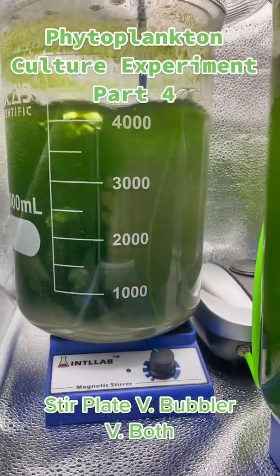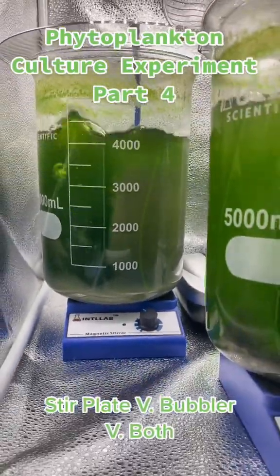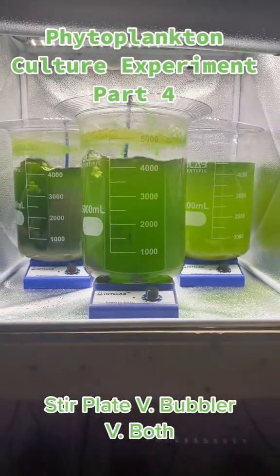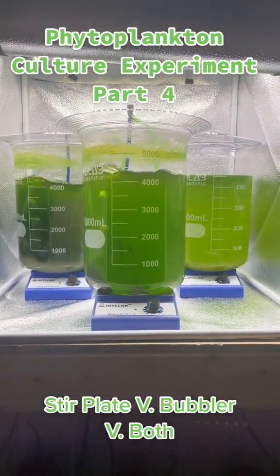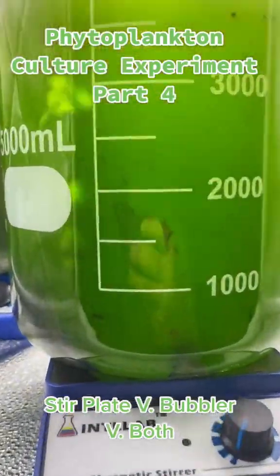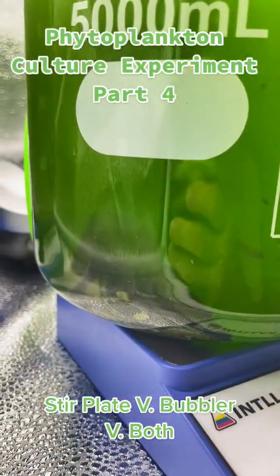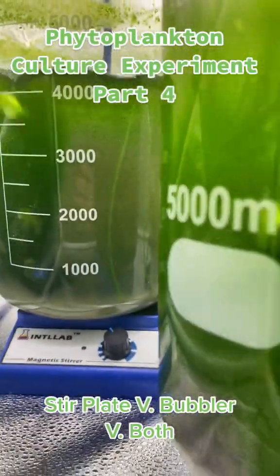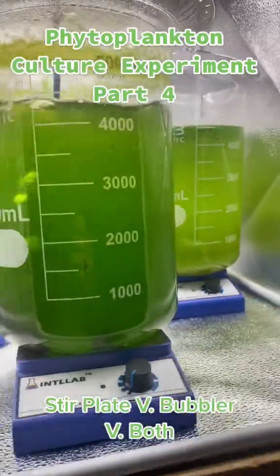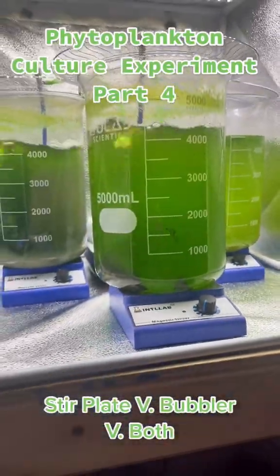The stir plate and the bubbler together seems to be doing a little bit better than that — no weird algae growth. And of course, just the stir plate is not doing well at all. I was reached out to by someone from Algae Barn, and they said they think the reason the stir plate alone is not working well is because the pH is probably skyrocketing, and I would assume that is killing the phytoplankton in there, or at least inhibiting its growth.